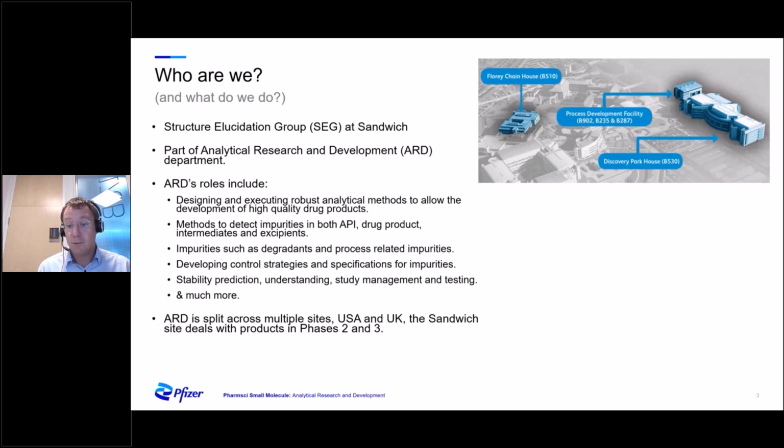We're also responsible for developing control strategies and specifications for these impurities, and for designing and performing the stability studies and subsequent modelling of stability data, which are used to underwrite a medicine's use period, and many other analytical activities. The department is split across multiple sites, both in the US and here at the Sandwich site, where we mostly deal with products in phases 2 and 3 of the drug product development life cycle.